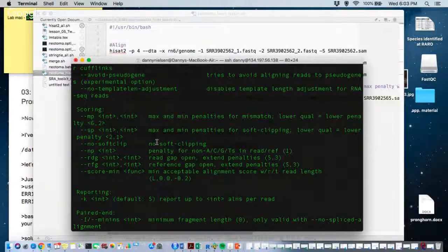Since I'm working with sequences from a wild wood rat, but I'm aligning to a reference genome that's a lab rat, I know there's probably going to be a lot of differences. So I'm just relaxing that stringency to see if it aligns a little more. Once I work through some of the other workflow, we'll actually be identifying genes.